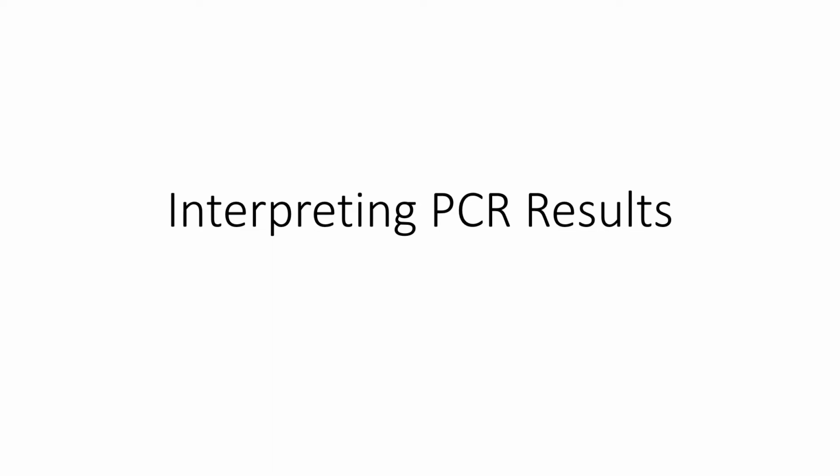PCR results. Just a disclaimer, I am basing this lecture on my experience working at a molecular laboratory for SARS-CoV-2 testing, where we performed RT-PCR. So my short lecture for today is based on that experience. But it's pretty much similar to other PCR tests.